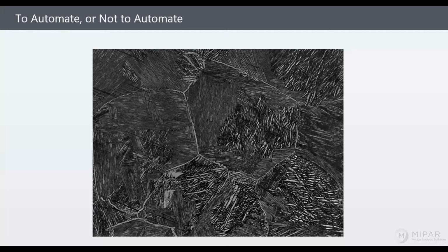And this is a particularly challenging problem to automate in that there is no intensity difference to be used with any sort of conventional thresholding approach. You have purely a texture-based feature detection problem, which our brains seem to be fantastic at recognizing, but historically has been immensely challenging to get software to recognize accurately and consistently.